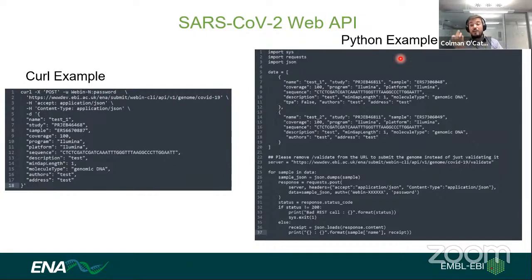So the Wellcome Sanger Institute piloted this when it was developed, before we made this public, and they've probably been able to manage 30 to 40,000 submissions in a week using this method. So it is incredibly efficient if you are just looking to basically archive FASTAs, not annotated sequences necessarily, but FASTAs in particular is the benefit here.